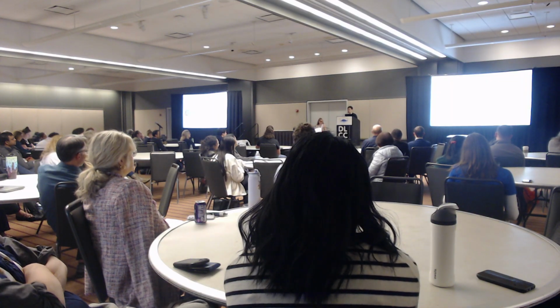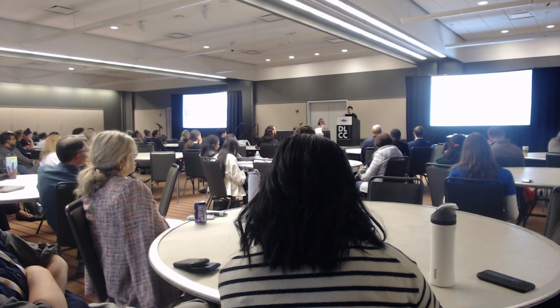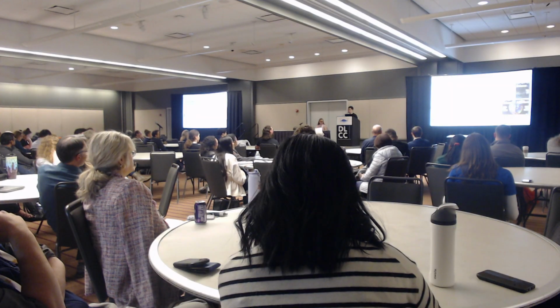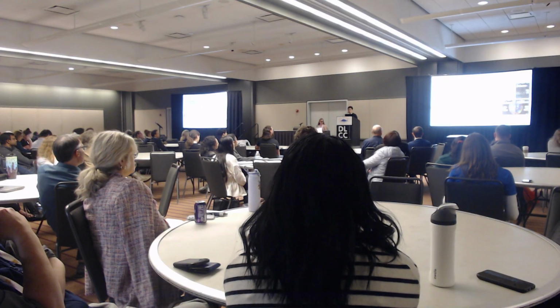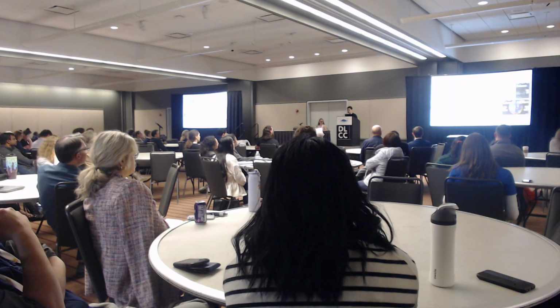So traditionally, bulk sequencing is widely used. However, we need to mix different types of cells as a bulk input, where we only get the average profiles from all cells, which will obscure the heterogeneity among different cell populations. To address this challenge, single-cell technologies are being developed, which can compartmentalize individual cells using either microfluidic devices or microwells to get distinct profiles from different cell types, so that we can get cellular states from individual cells to reveal the heterogeneity among different cell populations.